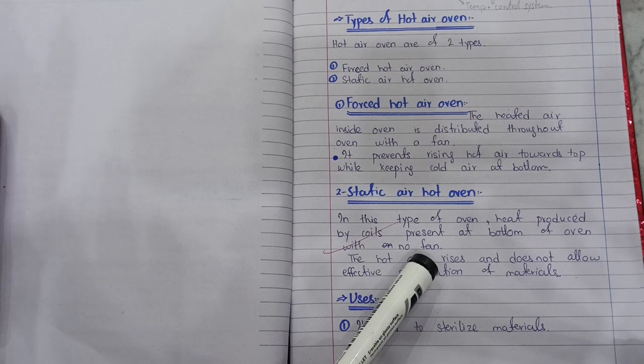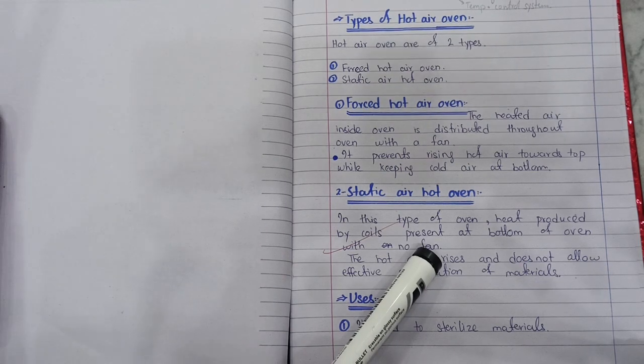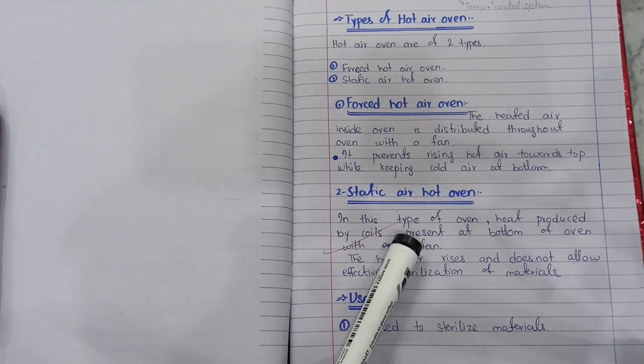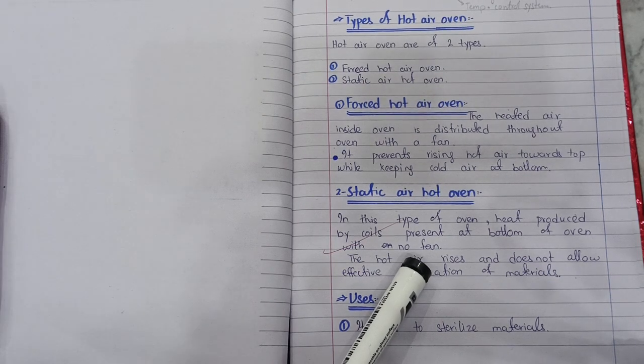सो अब क्या होगा, यानी सिर्फ हीटेड जो एयर है वो सिर्फ नीचे ही रहेगी, ऊपर नहीं होगी, ठीक है, या ऊपर जाएगी तो नीचे नहीं रहेगी. मतलब इस तरह का डिस्ट्रीब्यूशन यूनिफॉर्म नहीं है. जिस तरह उसके अंदर फ़ैन था तो प्रॉपर्ली डिस्ट्रीब्यूट हो रही थी ना एयर, यहाँ पर क्योंकि फ़ैन नहीं है तो वो प्रॉपर्ली डिस्ट्रीब्यूट नहीं होगी अच्छी तरह से. एक जगह ज़्यादा अगर हीटेड एयर है तो एक जगह बहुत कम होगी.